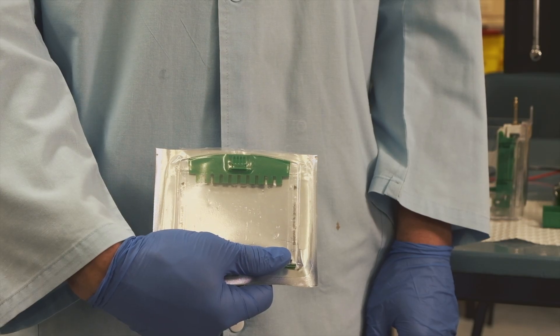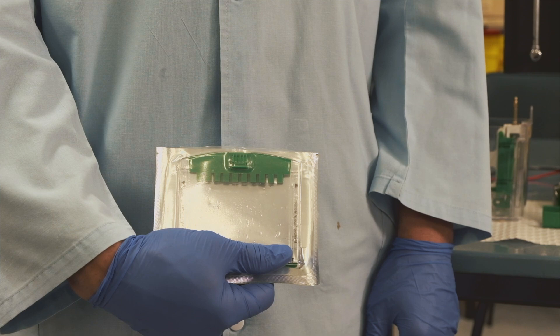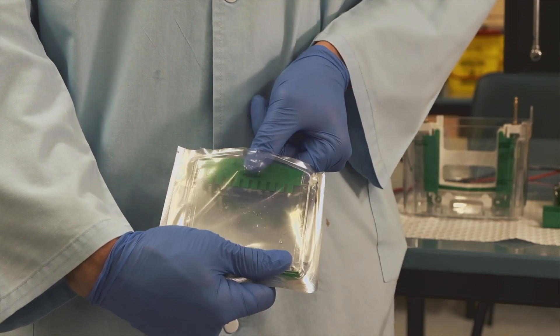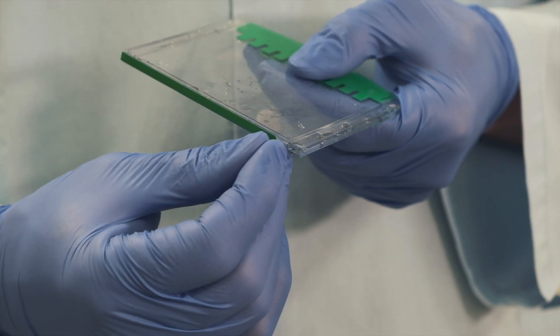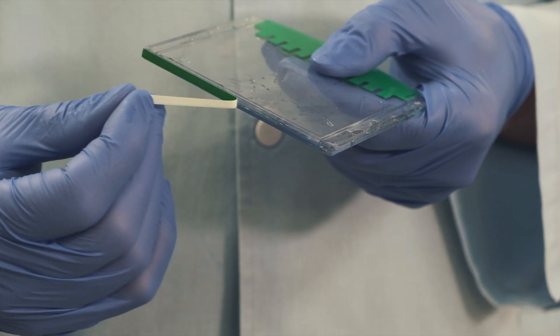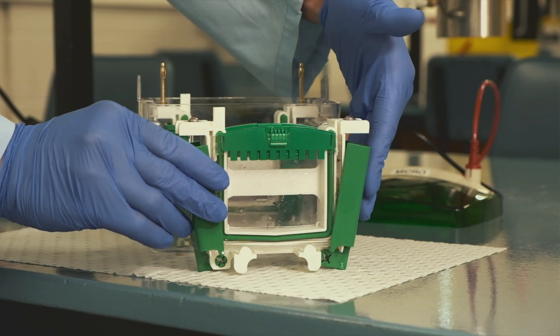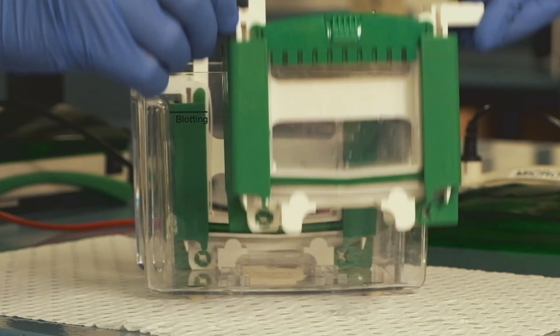Pre-made gels are usually sold in packets with some buffer in it to keep the gels moist. Before setting up the gels, it is extremely important that you remove the strip at the bottom of the gel. The strip is initially there to keep the gel in place. However, it will hinder the protein separation if it's left on during electrophoresis.